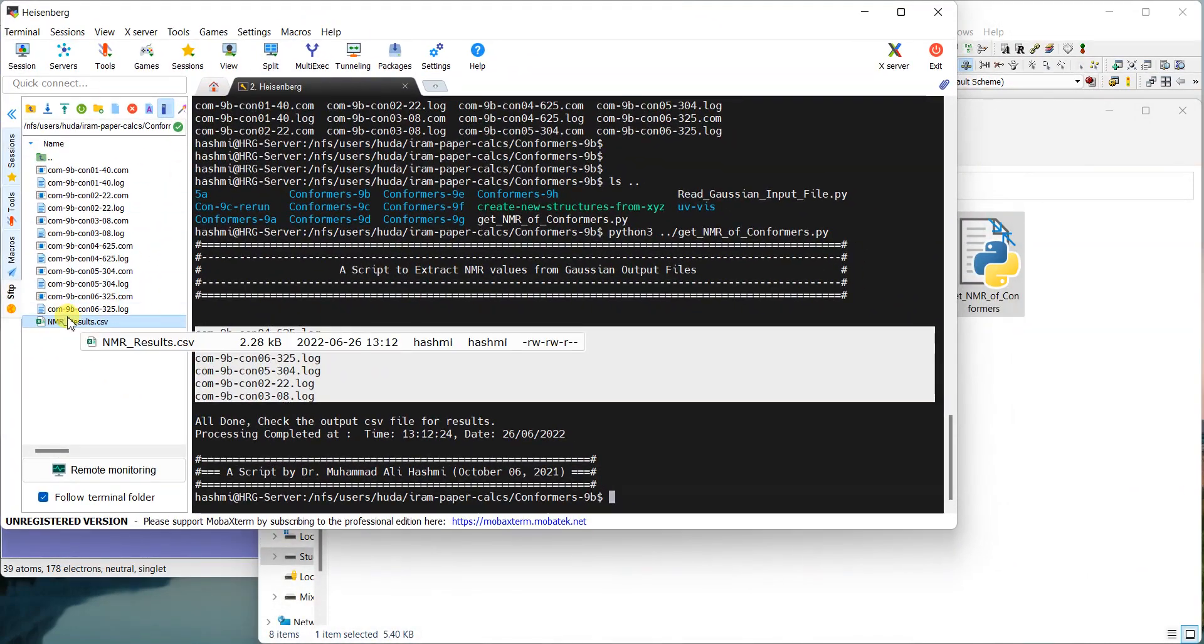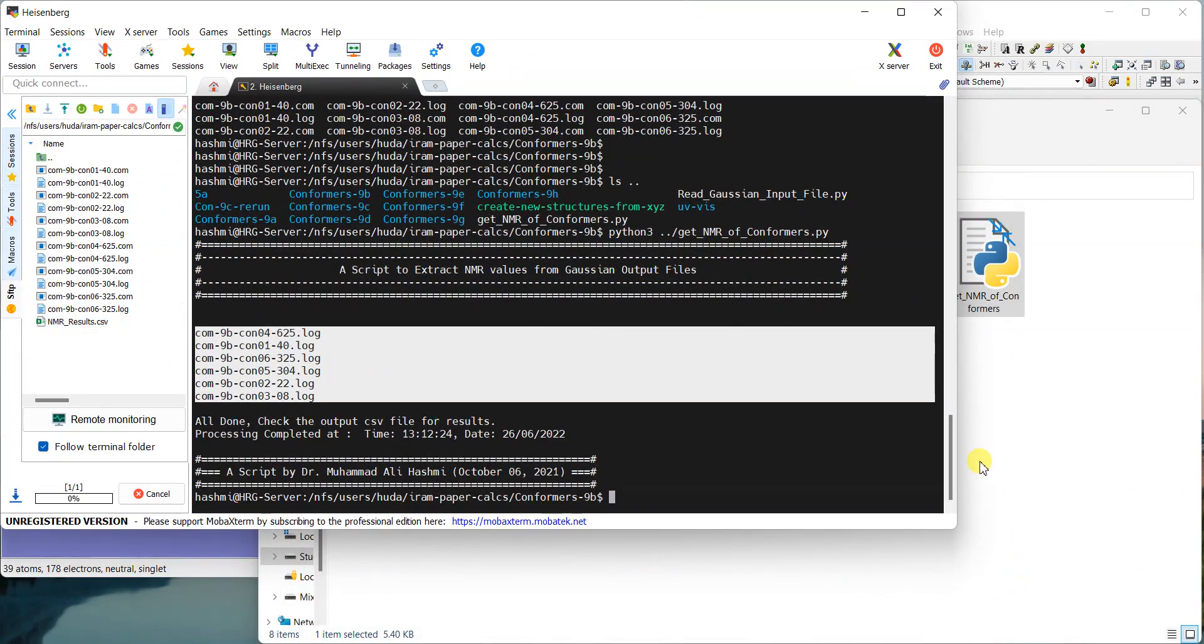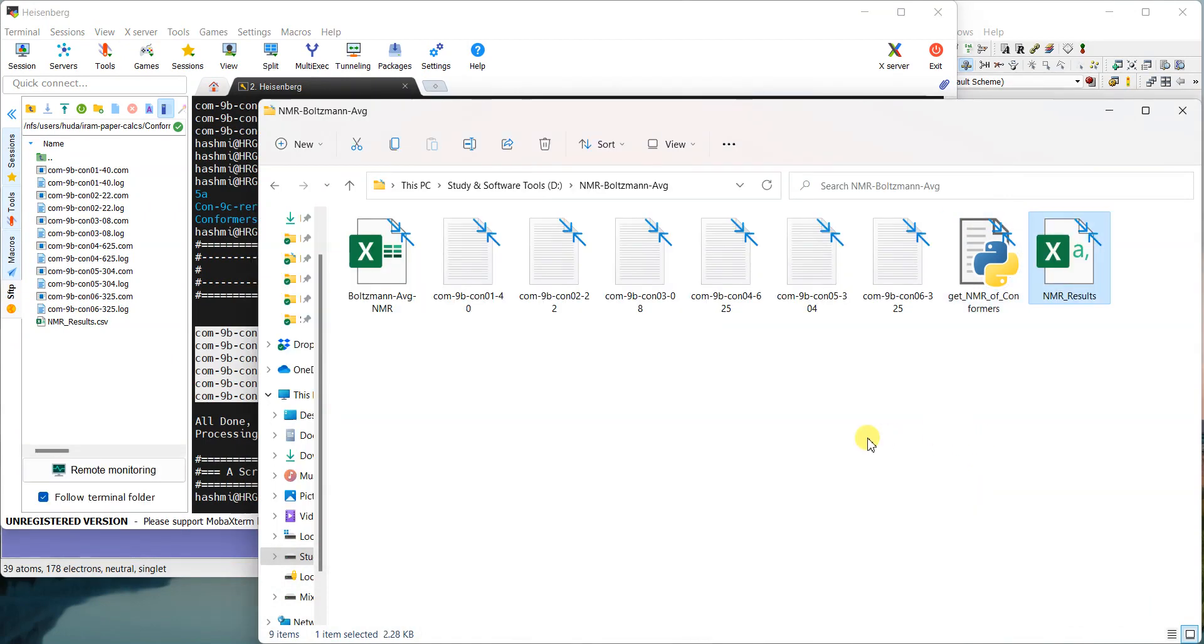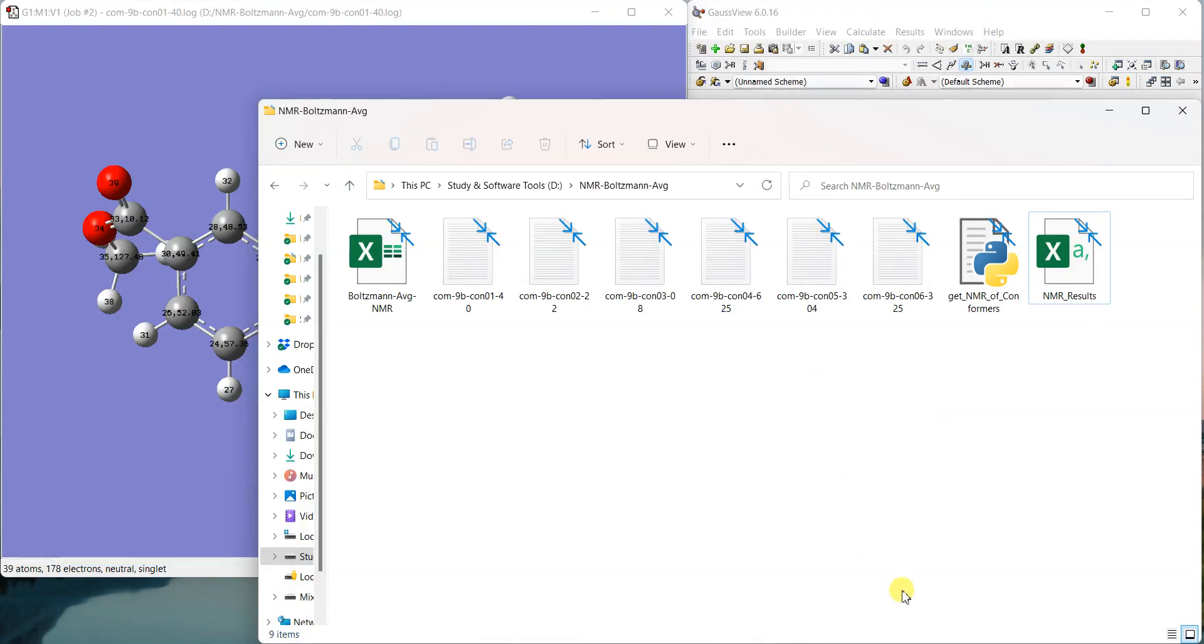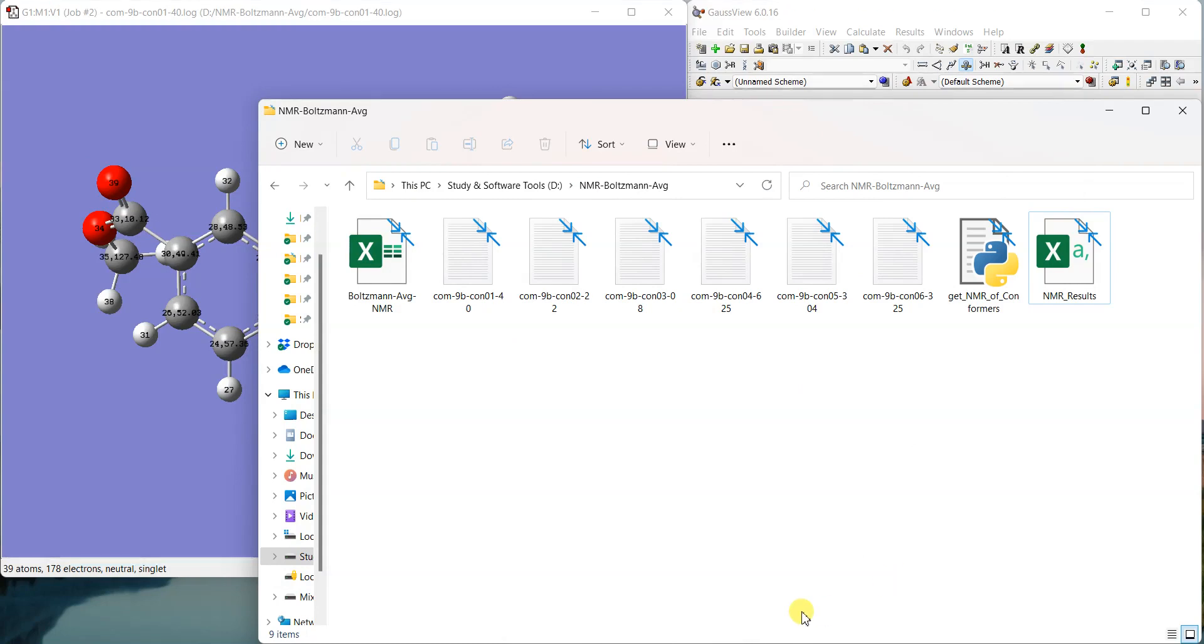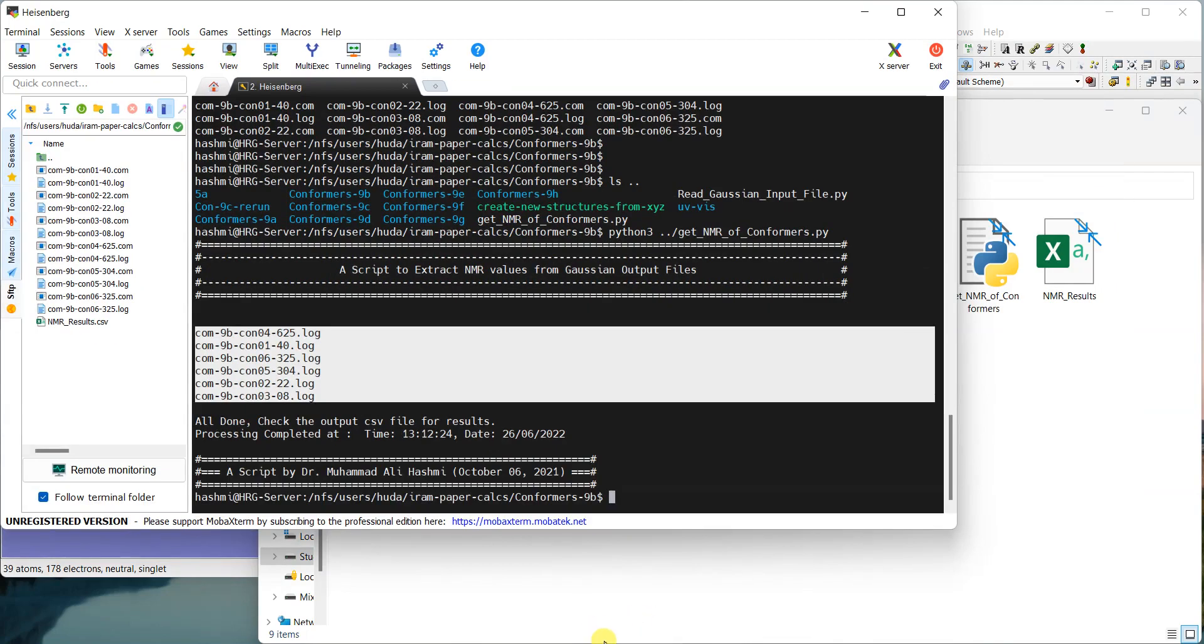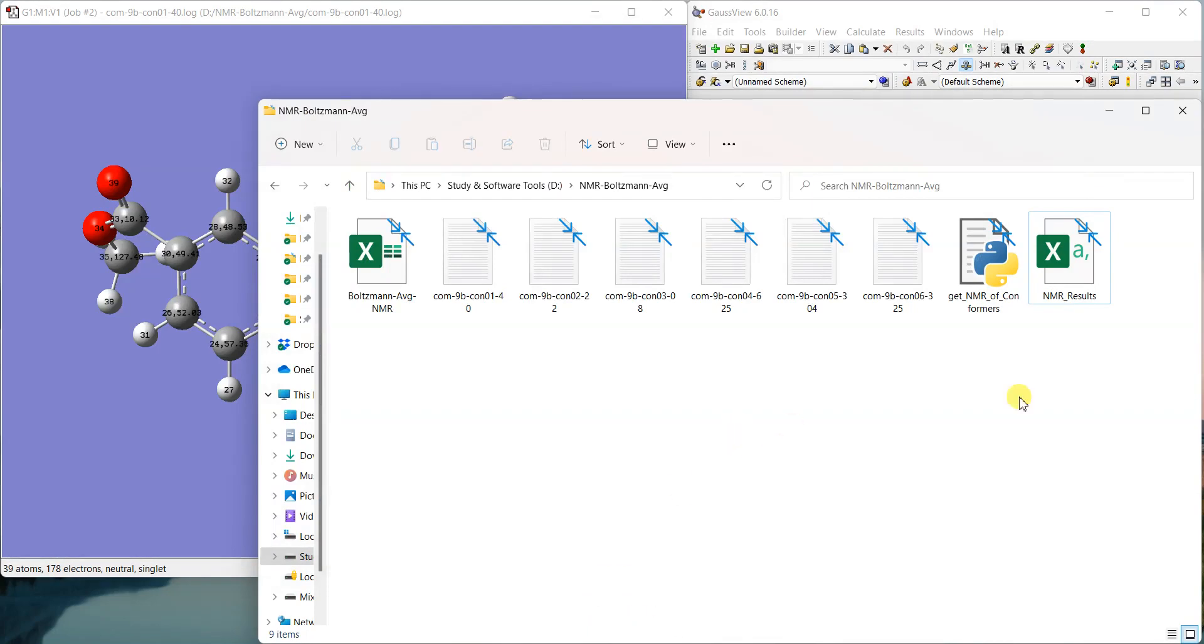If I copy that file to my machine, now I'll just drag and drop here. I believe you can also use the option of installing Ubuntu within Windows, which is called Windows Subsystem for Linux. You can use that one as well, but I had a Linux computer so I just used it via SSH here and then I run the script over there.